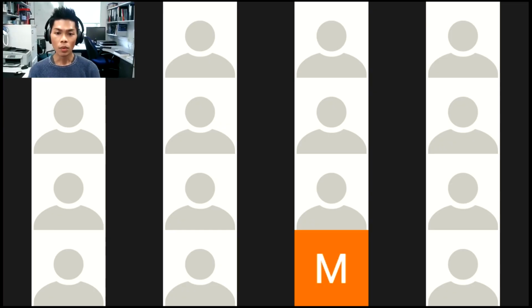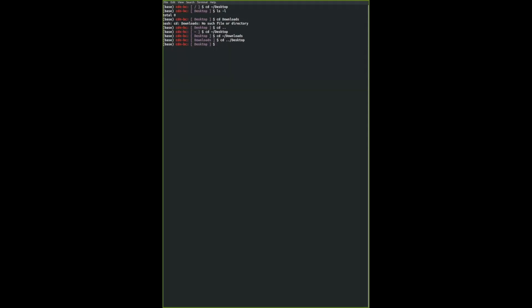Cool. Next part is quite interesting. We can now make things. On your Windows Explorer or on your terminal, you're able to right-click and create a new folder. You can create new files using a text editor and stuff. So we're going to do exactly that in terminal.